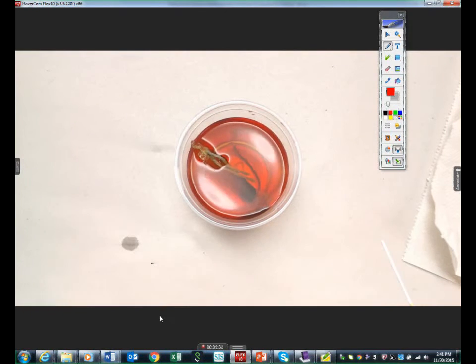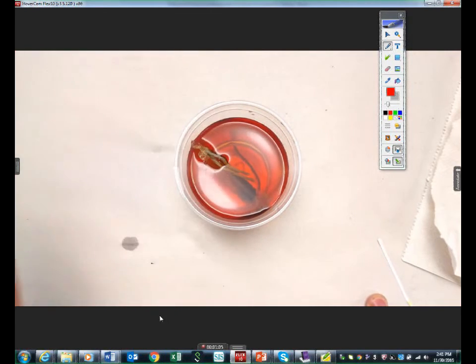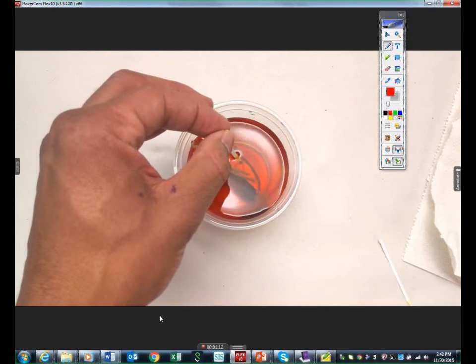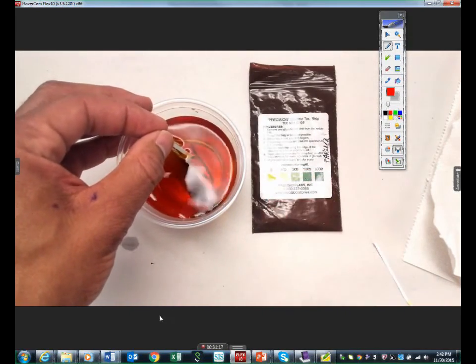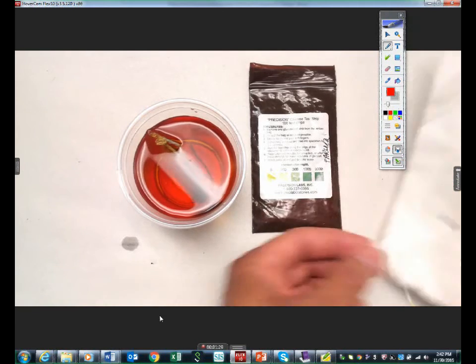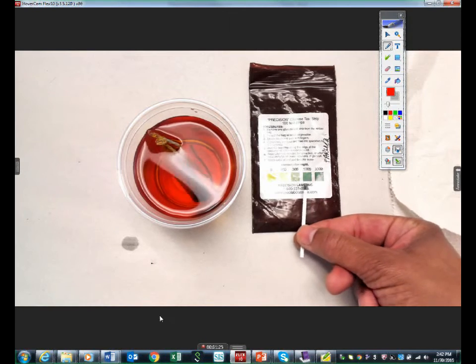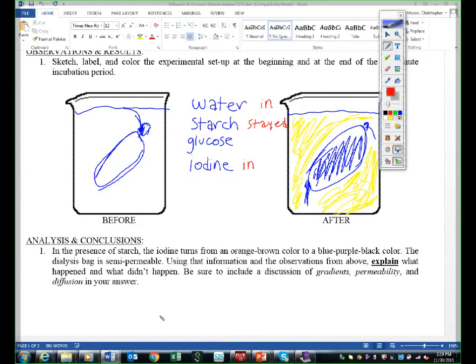All right, so you guys have your test strip. You're going to basically stick this in and hold it. You should be doing this at your seat — put your strip in. Now you're going to take it out and compare it. If it turned a dark green, as you can see here, glucose is permeable to this bag. Glucose diffused out and is now in the water. How do we know? We have a positive glucose test of the water.